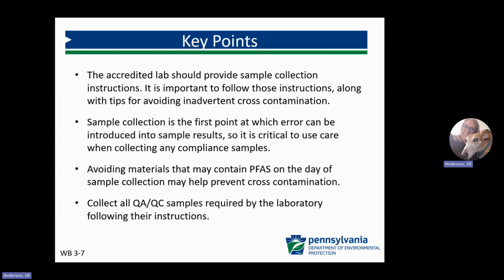That concludes Lesson 3 on sampling considerations. Let's review these key points from this lesson. The accredited lab should provide sample collection instructions. It is important to follow those instructions along with tips for avoiding inadvertent cross-contamination.